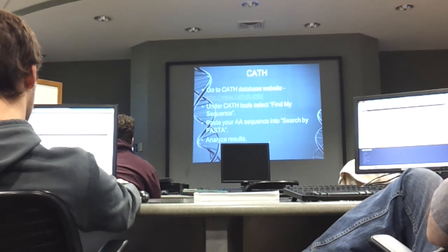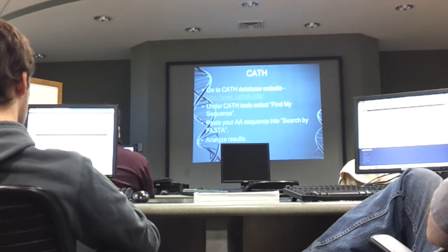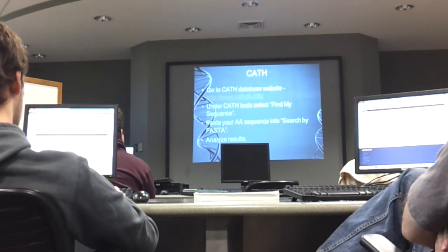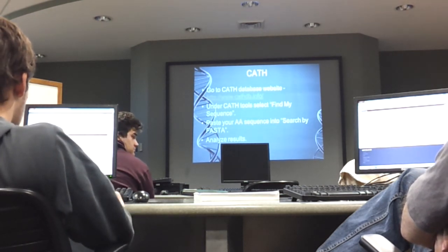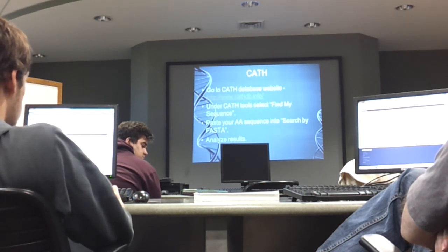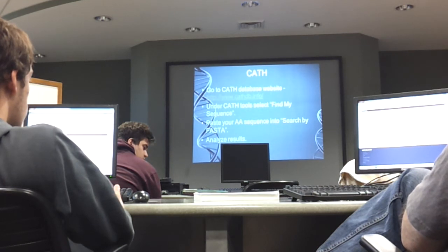How long was the sequence that we used, like how many amino acids long? About 100. Insulin's only like 100, if that. It's a small guy. It says aligned length 83, 83, for most of them 85, 77. So it chose to match them up for part of the sequence, and it recognized there's some parts that just don't match up, so it leaves them off the comparison. There's 100 amino acids, but they don't all always match, so it only chooses the part that's reliably matching, which we call local alignment.